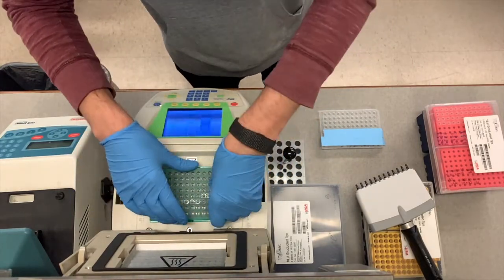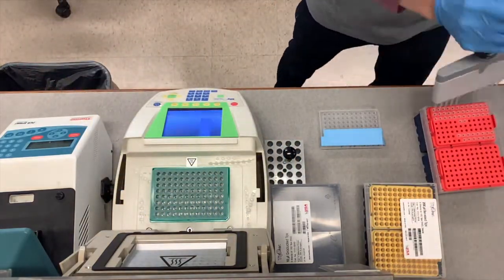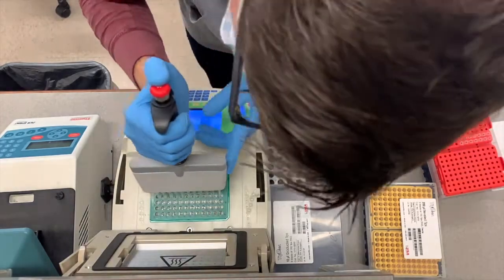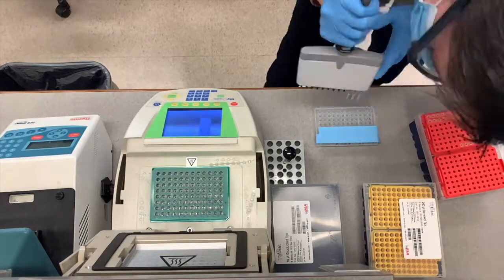So real quick, we're just removing the tops of the tubes, and then we're going to go ahead and add in those 5 microliters of quench buffer. Once the buffer's loaded, we're going to let this run for 30 minutes at 50 degrees C, and that's going to complete the quenching.